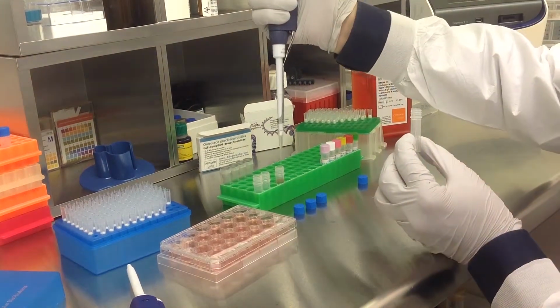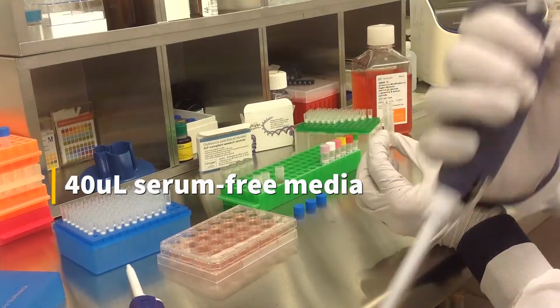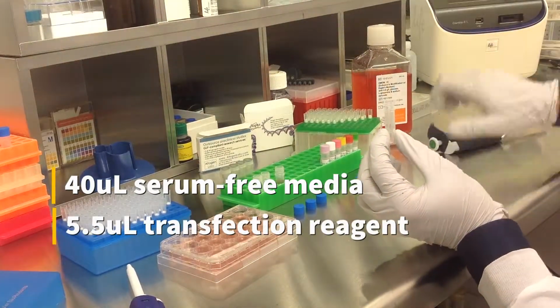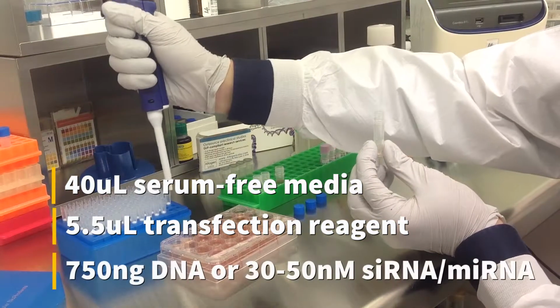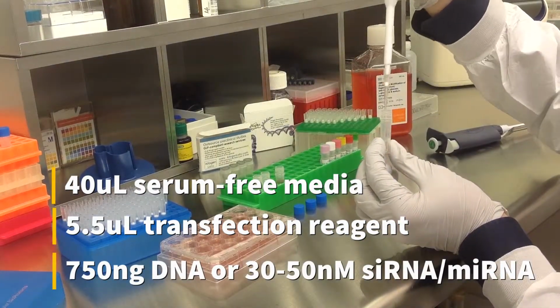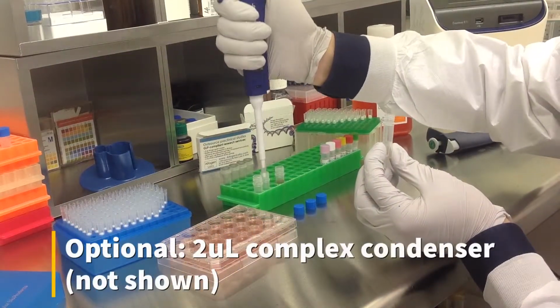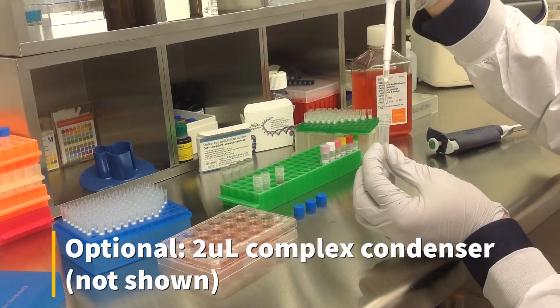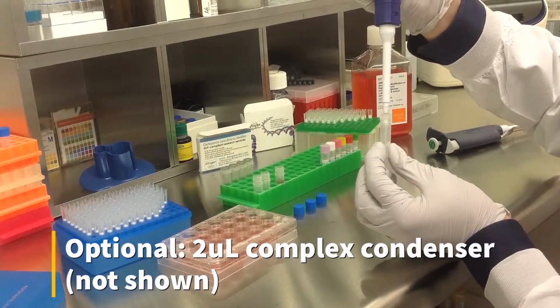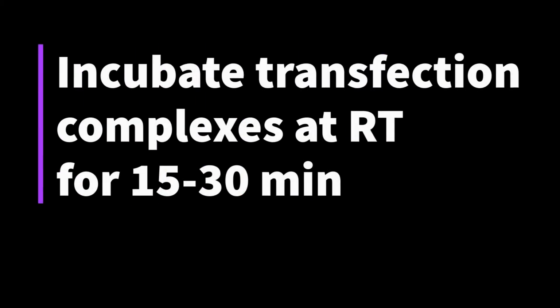To prepare transfection complex, mix 40 microliters of serum-free medium, 5.5 microliters of transfection reagent, and either 750 nanogram of DNA or 30 to 50 nanomolar siRNA or microRNA. An optional step is to add 2 microliters of complex condenser, which increases transfection efficiency but may also increase cytotoxicity. Incubate the prepared transfection complexes at room temperature for 15 to 30 minutes.